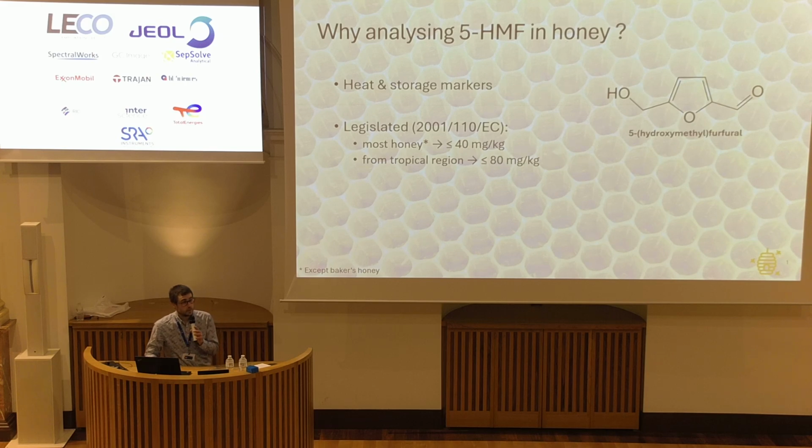The maximum content of this compound is legislated by the European Union, but also in the USC legislation, for instance. And so the general limits that are well known are 80 milligrams per kilo and 40 milligrams per kilo.